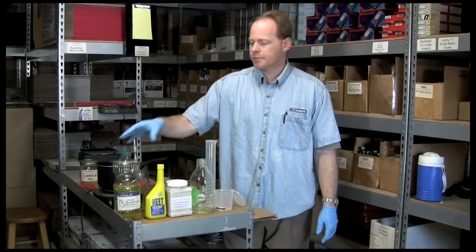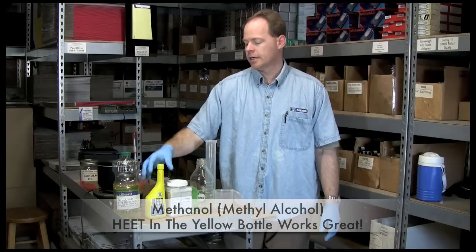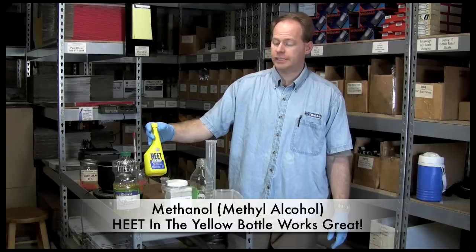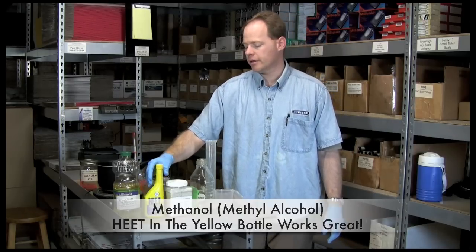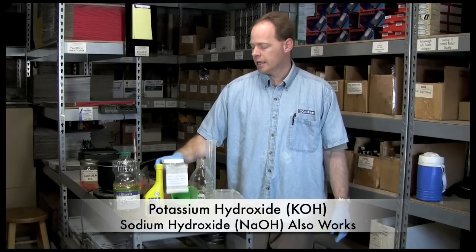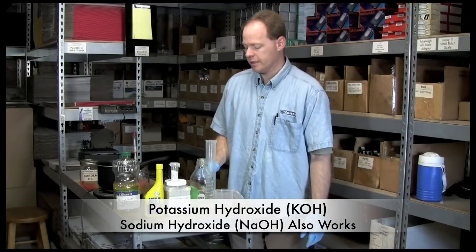First of all, to make this batch, you're going to need some canola oil that can be picked up at a local grocery store. Some methyl alcohol, available at a local grocery store or auto parts store — this is a yellow bottle of HEET, 100% methyl alcohol. Some chemicals — this is potassium hydroxide, you can get this from Utah Biodiesel Supply. I like potassium; you can also use sodium hydroxide, but potassium likes to dissolve better in methanol.